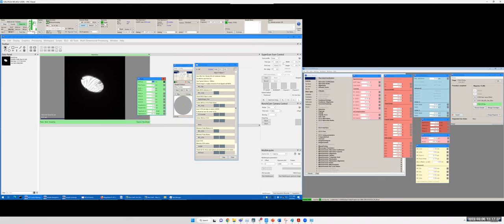Okay, and then actually I want to go back a little bit. I want to go to a minus 1,500 nanometer defocus. So I have a portion of the field of view. You can see this is a gold sample. You can see a lot of gold particles.